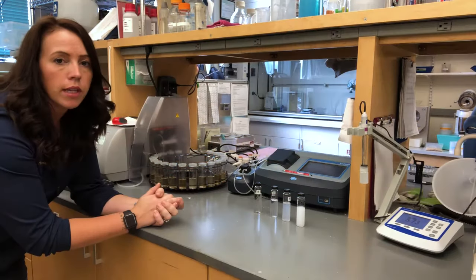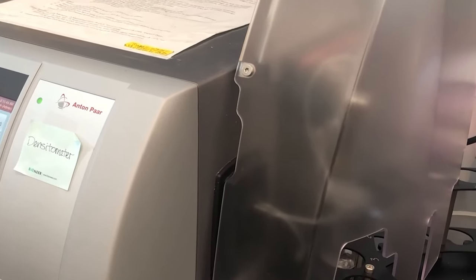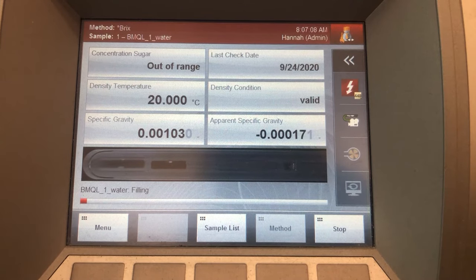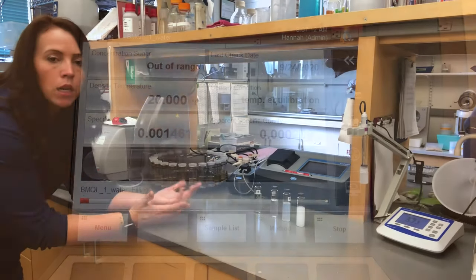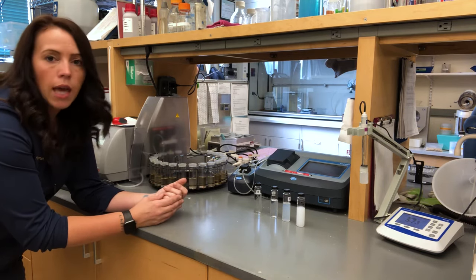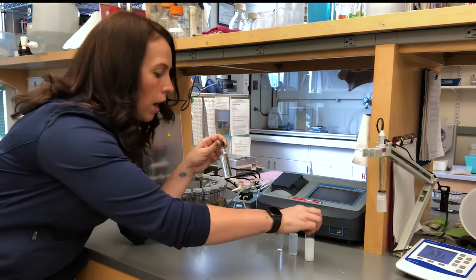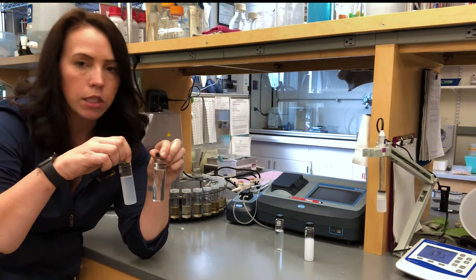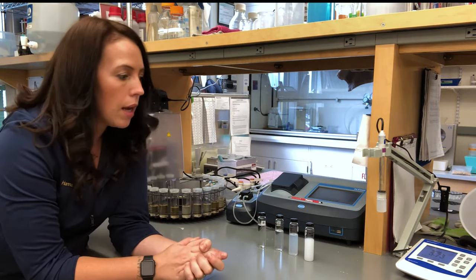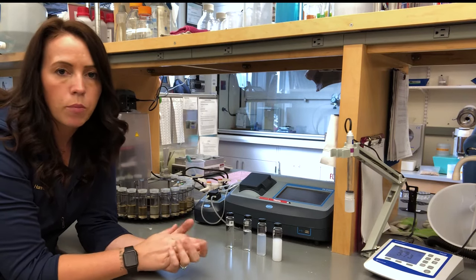Once our wort has finished filtering — a process that takes about an hour — we come over to our density station. There are actually three things we're going to measure here. First, we've got our densitometer with an auto sampler, which is very convenient for the high number of samples we're running each day. This machine picks up the sample, runs it through a very fine hand-blown glass tube, and then a vibration on that tube tells us how dense the sample is — essentially a measure of the soluble sugars and other soluble aspects of the grain that went into the wort during mashing. We'll also look at turbidity, or the haziness of the sample — it passes light through and if that light is obstructed or not, it calculates a turbidity value. And the final thing at this station is pH, which can also be very telling for a maltster about how their process went.